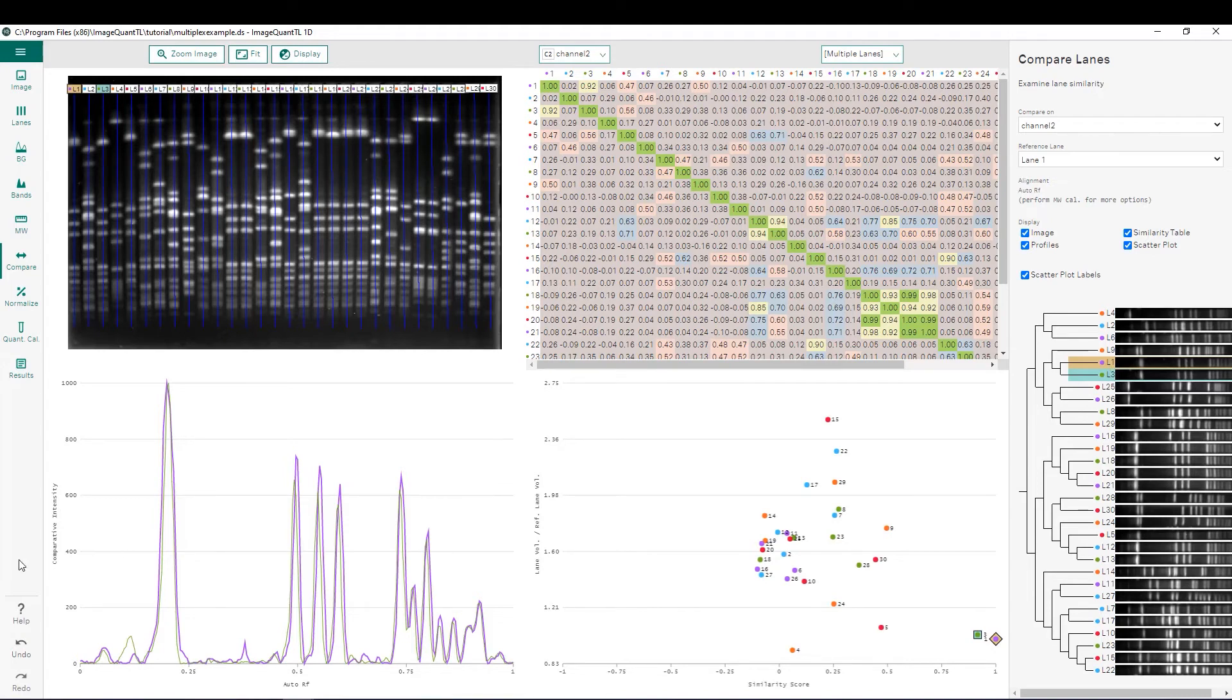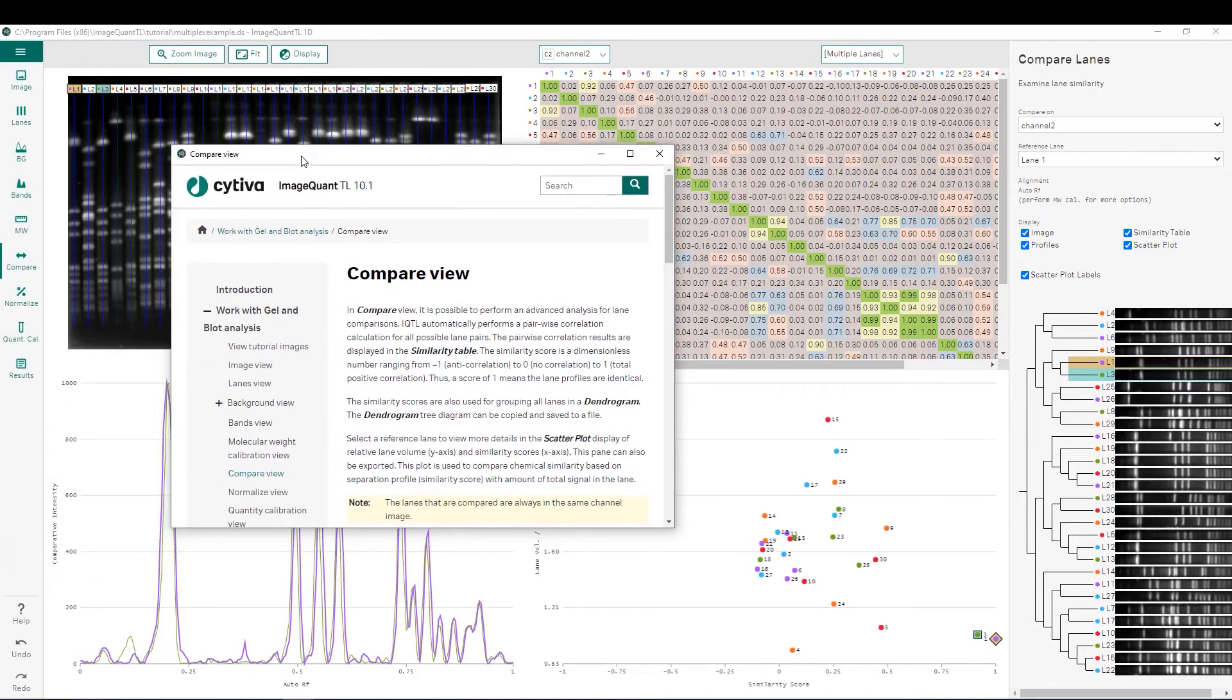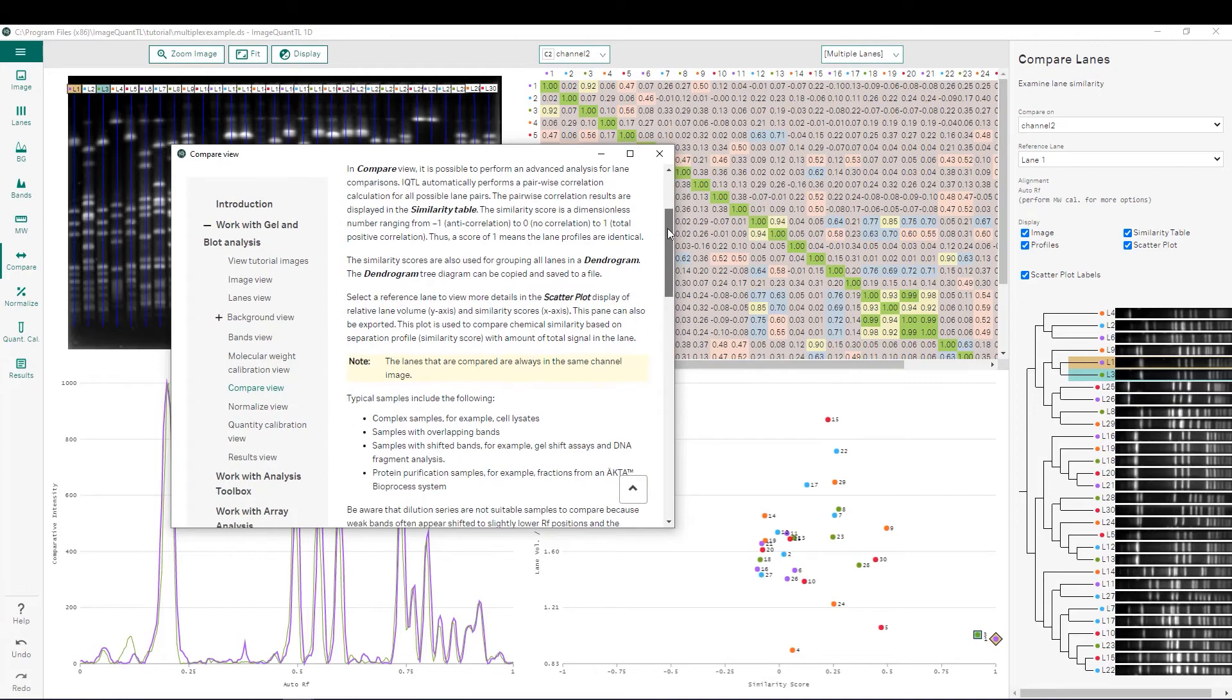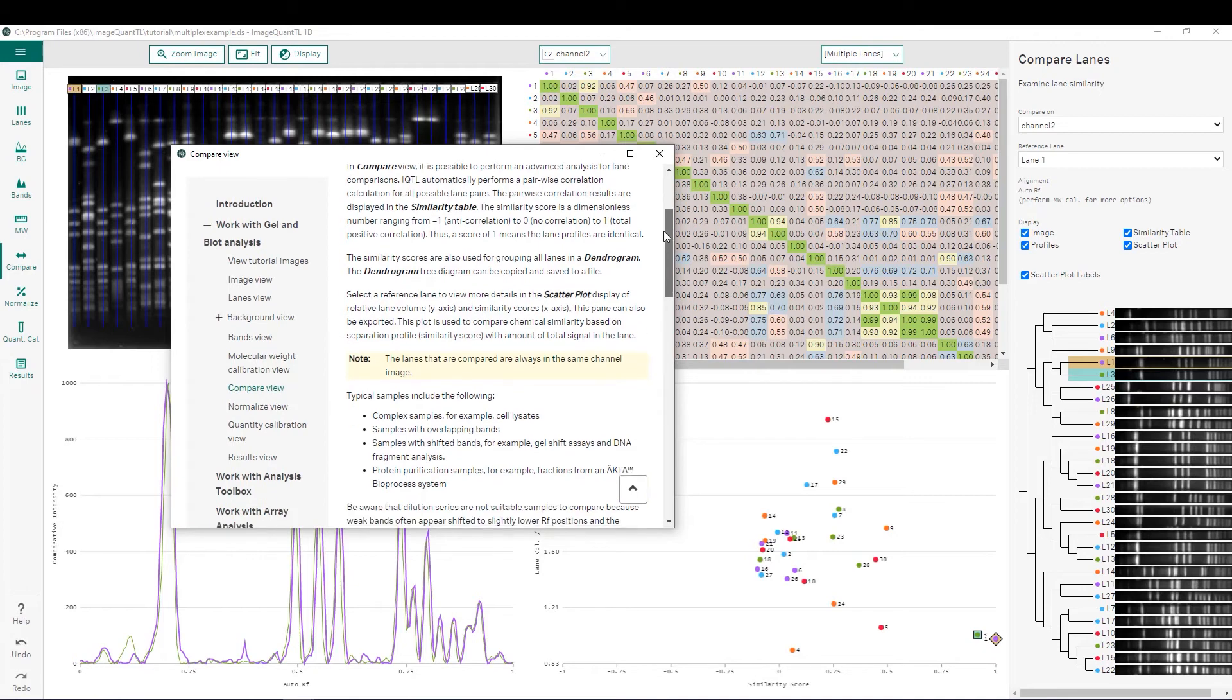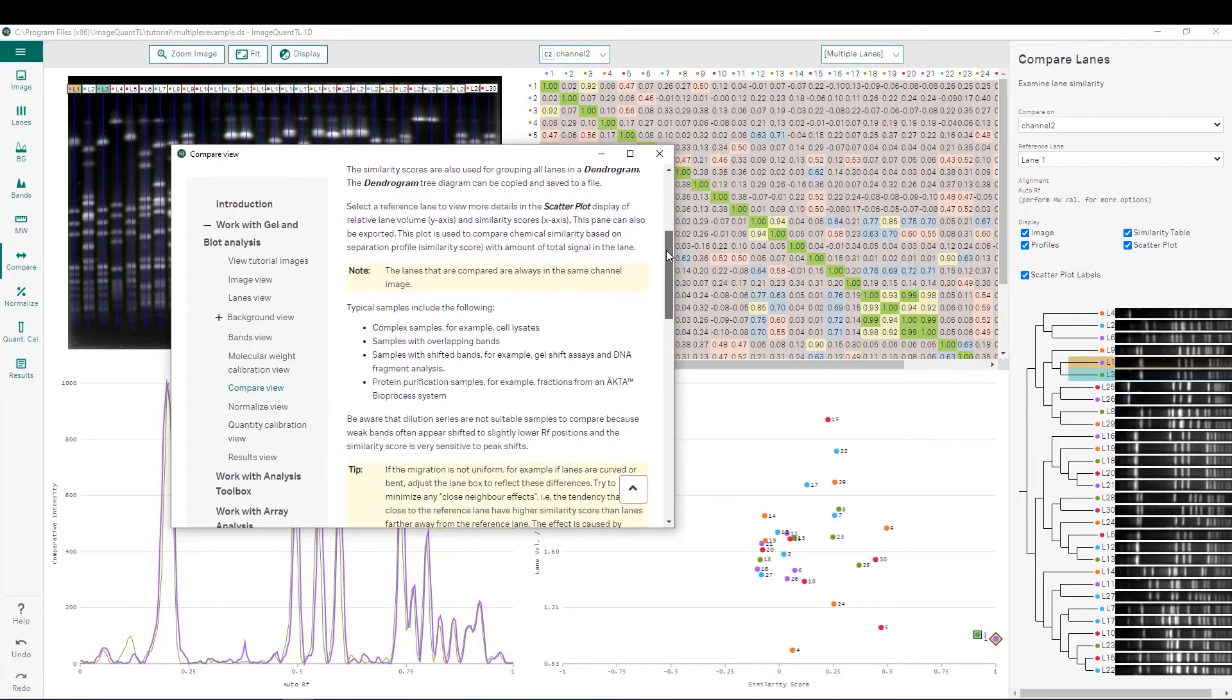At any point during this process if you need more elaboration or more help you can simply choose the help function over here, and that brings up a new window which goes into more detail about the specific step which you were on. So this will guide you through how to do a lane intensity comparison between different lanes.